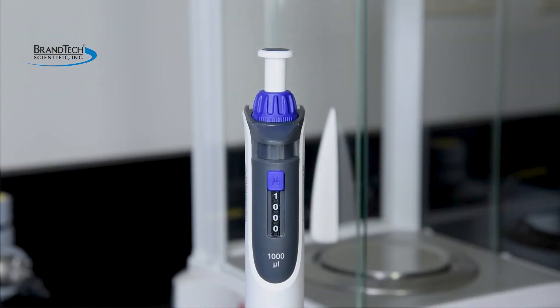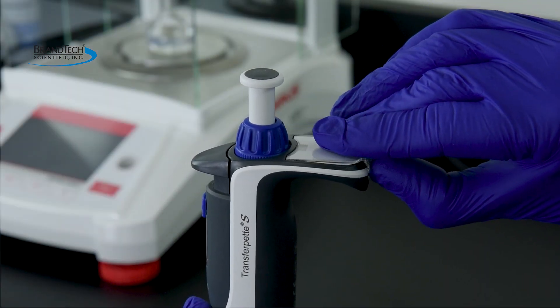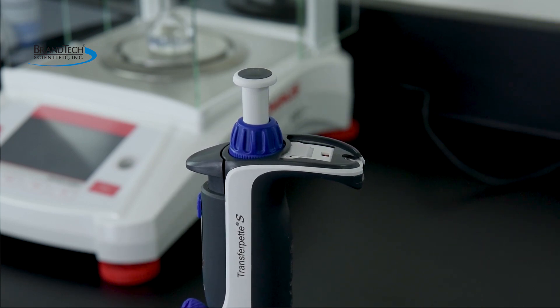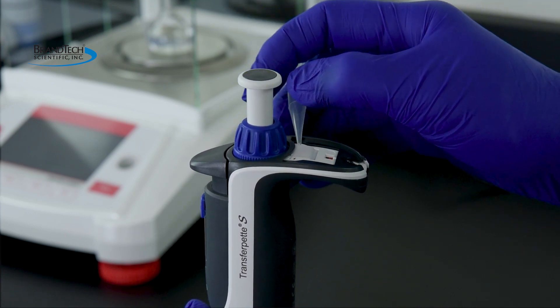The transfer pad's display is easily adjusted to the gravimetrically determined volume. The easy calibration feature is integrated into the finger rest. To adjust it, remove the labeling window and the labeling tag, then remove the protective tab to reveal the red adjustment slider.